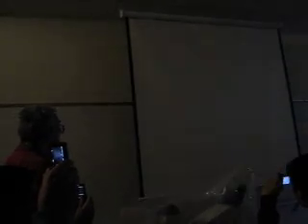A nice neck canal right there. Or yours might be stained like this: neck, venter, egg, nucleus, nucleolus of the egg. You might get something like this — that's more than one cell, so that's probably a little embryo something to grow inside the archegonia.